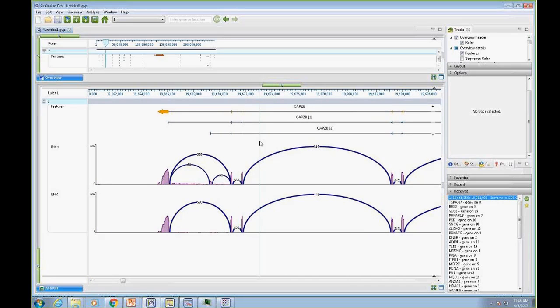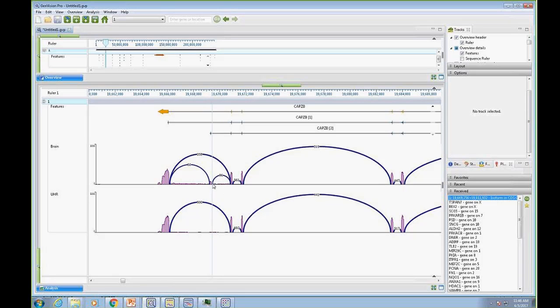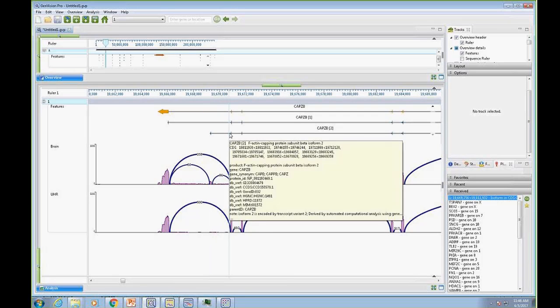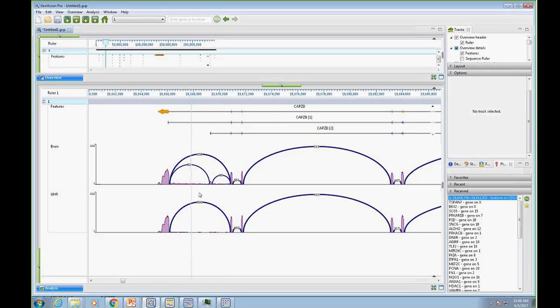And so again, this gene is expressed at about the same level in the two tissue types. And I just used the isoform table. And what it's detecting is this isoform 2. If I hover over it, you can see it's got this exon that defines that isoform. That makes it different from isoform 1, which doesn't have that exon. So we're detecting that in ArrayStar, and we could see that it occurred in the brain and not the UHR by the fold change for that particular isoform.